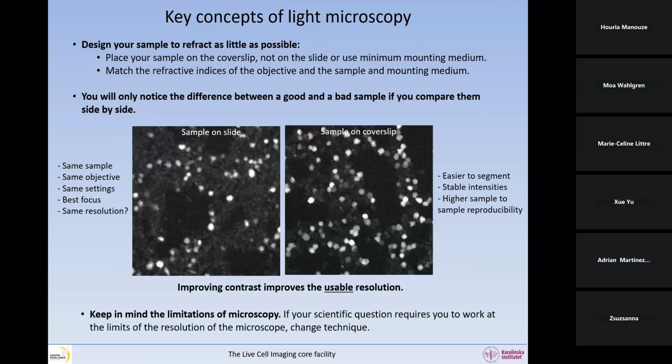So keep in mind also the limitations of a microscope. We cannot have infinite resolution, and you need to design your scientific question with this in mind. If your scientific question requires you to work at the limits of the resolution of the microscope, you should change technique or you should change scientific question. So working at the limit of the resolution of the microscope is extremely, extremely risky. So this is my opinion.